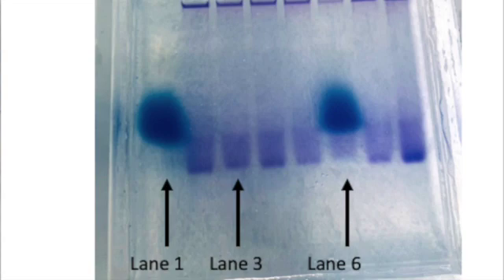In lane one there is one big dark blue blob — that's one band. It's not very crisp but that's okay. In lane three we have a purple band, and again that's just one band. But look at lane six — lane six is interesting because we have two bands: the blue band and the purple band. The higher-up blue band represents the allele for sickle cell anemia. The lower-down purple band represents the allele for normal hemoglobin. If you have two bands it shows that you have both the allele for normal hemoglobin as well as the band for sickle cell — that means you're heterozygous.